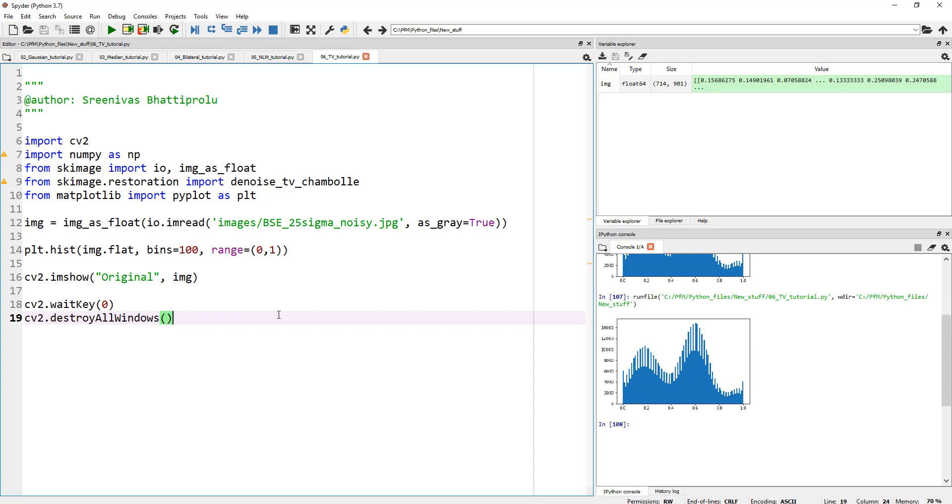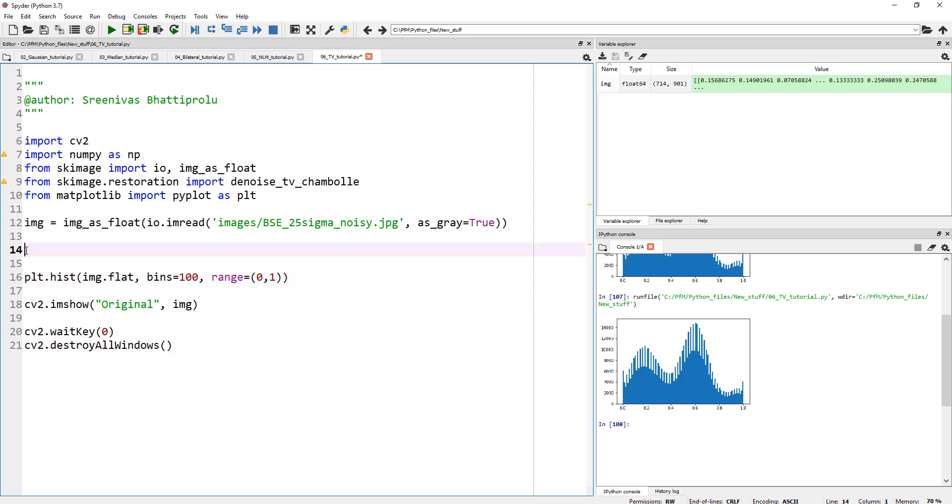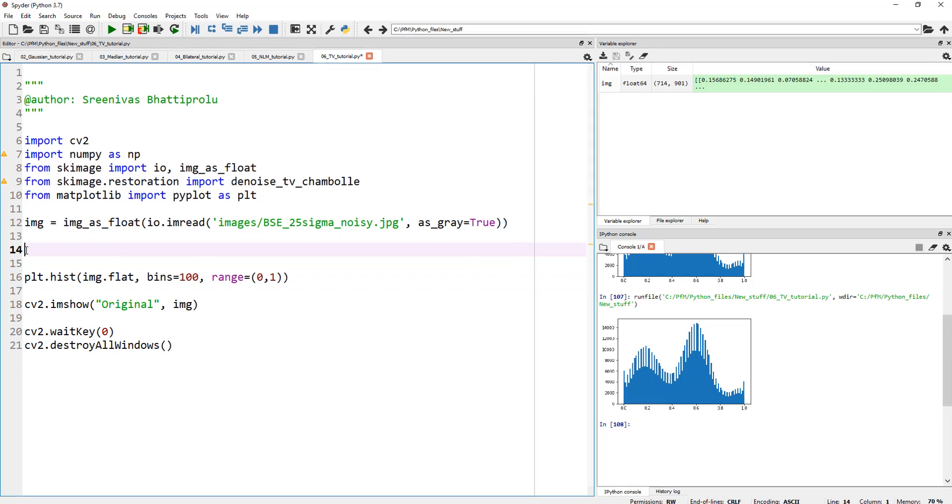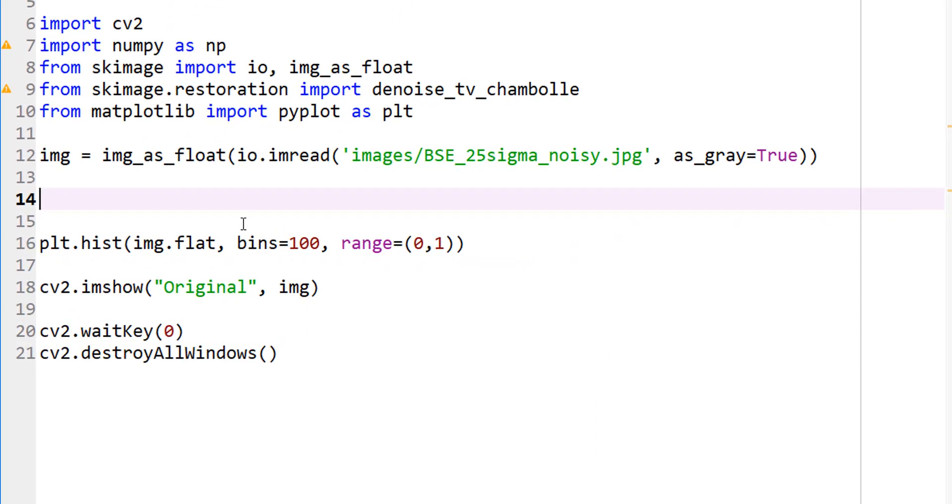So if you are planning on segmenting this image, this can be a nightmare. That's why we need to clean it up. So let's leave that plot histogram as is, and let's go ahead and denoise this.